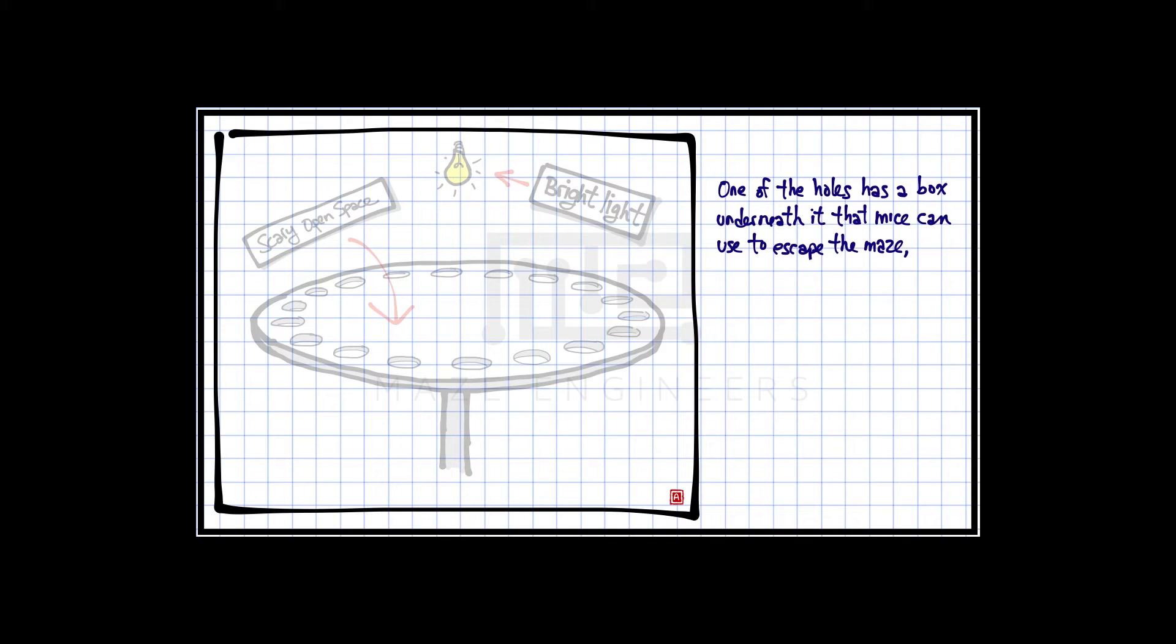One of the holes has a box underneath it that mice can use to escape the maze, while others lead to an abyss.